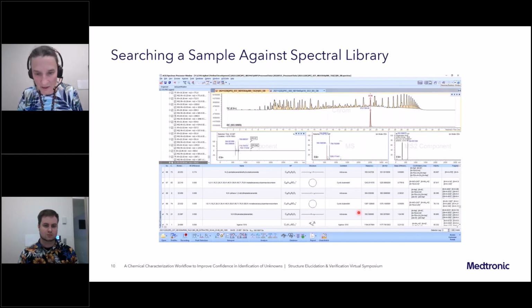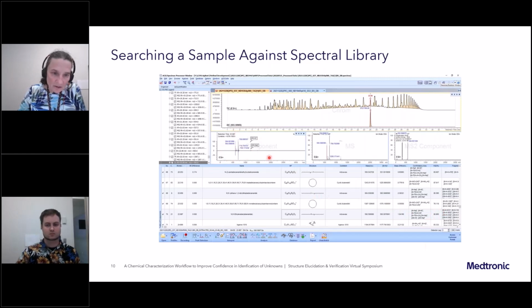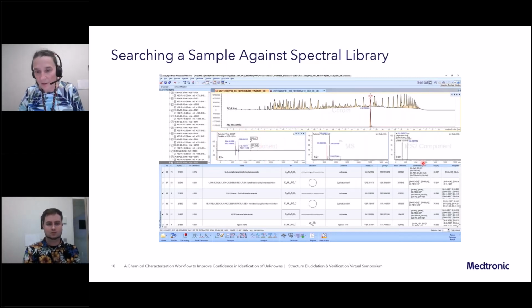And in this case, this is the test article. And the assignment, the hit quality for which is the hit quality index, which is this HQI % that's expressed right here, which is evidenced in the component spectrum where you can see the actual mirroring of the reference spectra to the experimental data up here with annotation of the actual different adducts that comprise this spectra.